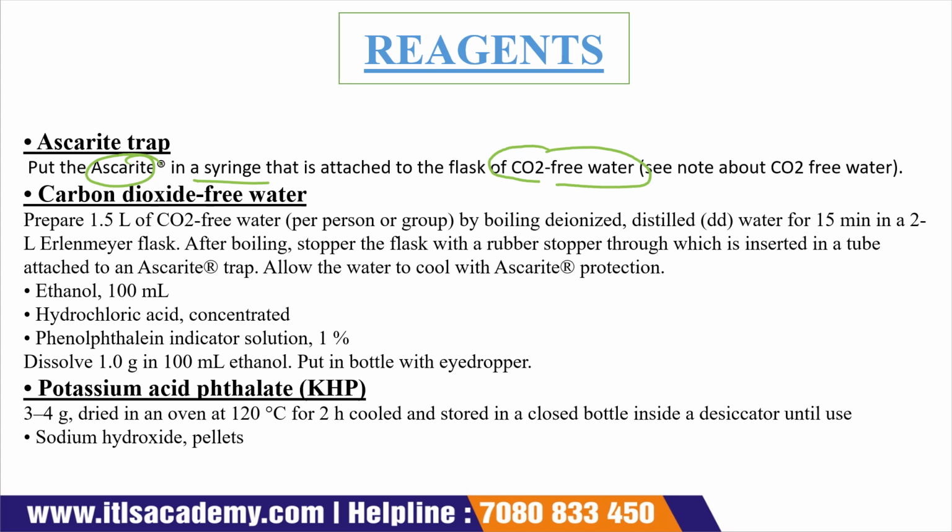Suppose that this is a syringe. In the syringe, we put ascarite. Now this is attached to a flask. Suppose that this is your flask. In this flask, CO2 free water is present. This is how we prepare the ascarite trap.